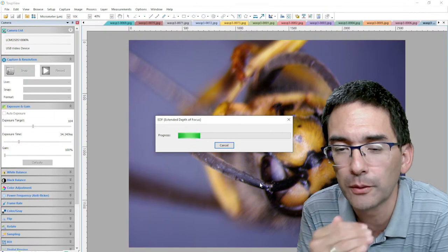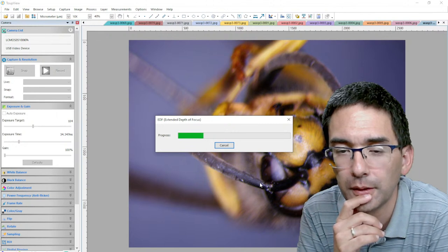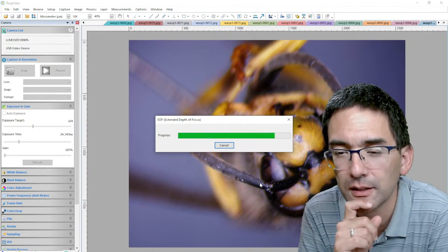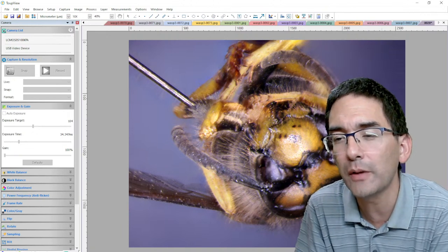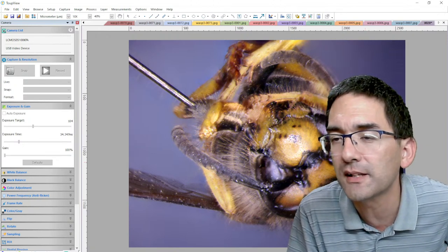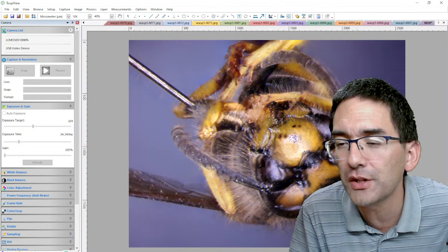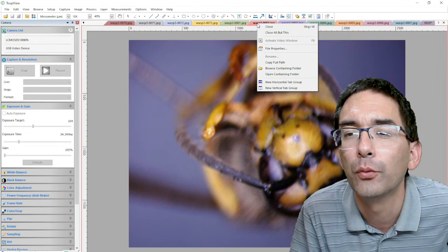Many image software programs need to have the images in a proper order. But the file names are numbered appropriately, so maybe this program is able to recognize this. Yep, it worked a little bit. You see over here, there are some strange artifacts now. And I think the reason is there's a shift here, maybe because I did not put the images in the correct sequence now, and before it was.